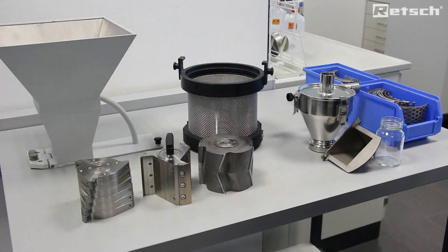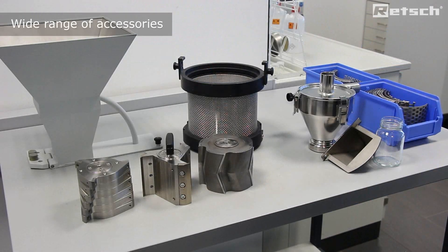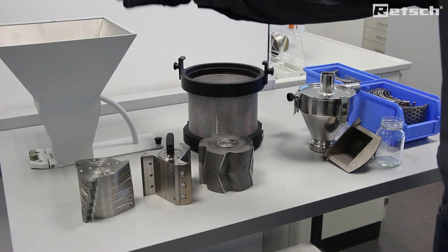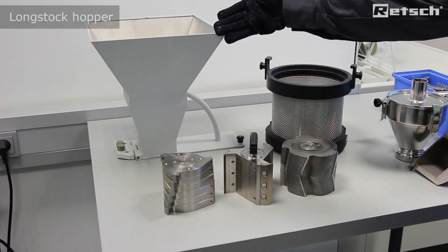We offer a very wide range of accompanying accessories. Previously, we saw the instrument supplied with a universal feed hopper. Here, we can see a second type which we call the long stock hopper.